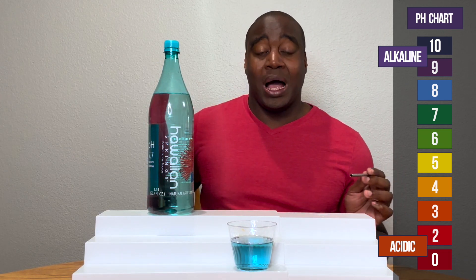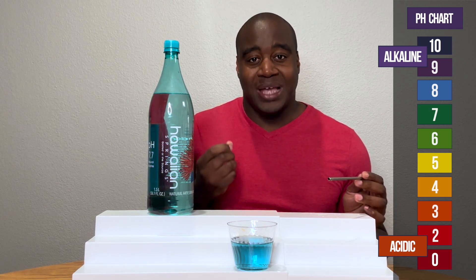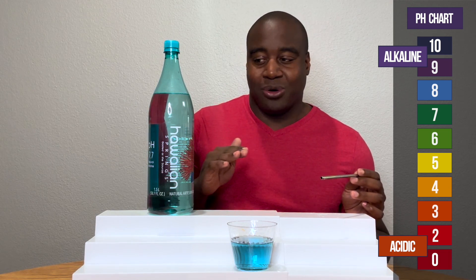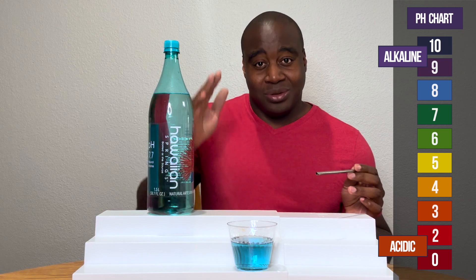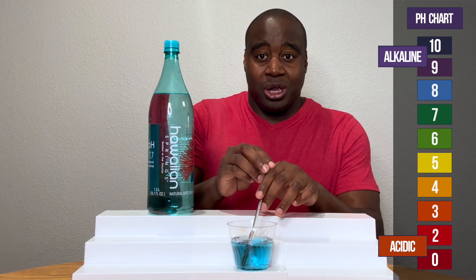Because it's showing alkaline, I want to blow into it and see how strong it is at handling acidity. If it's strong, it's going to maintain its color. If it's weak or there's something up with it, it's going to weaken — it's going to show its true pH. So let's see what we get here with Hawaiian springs.